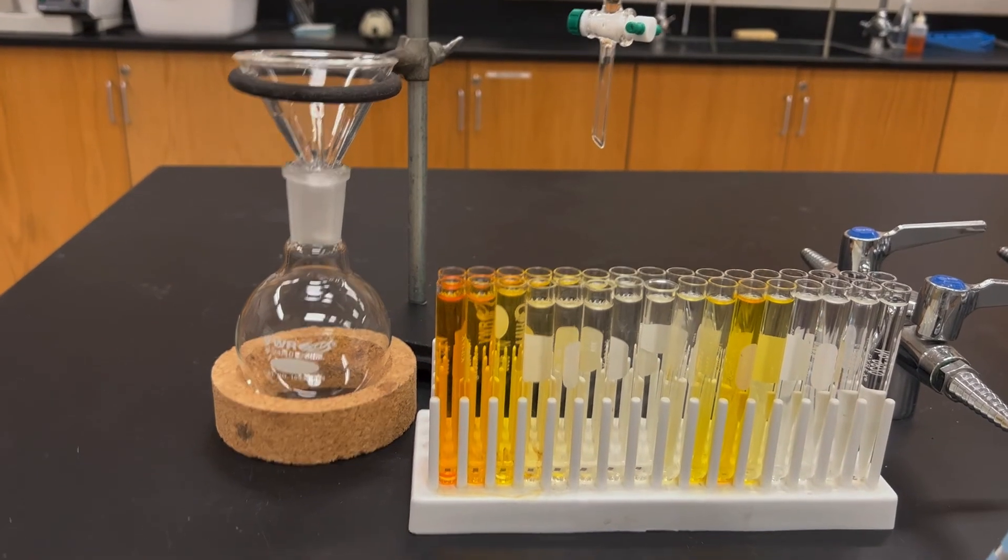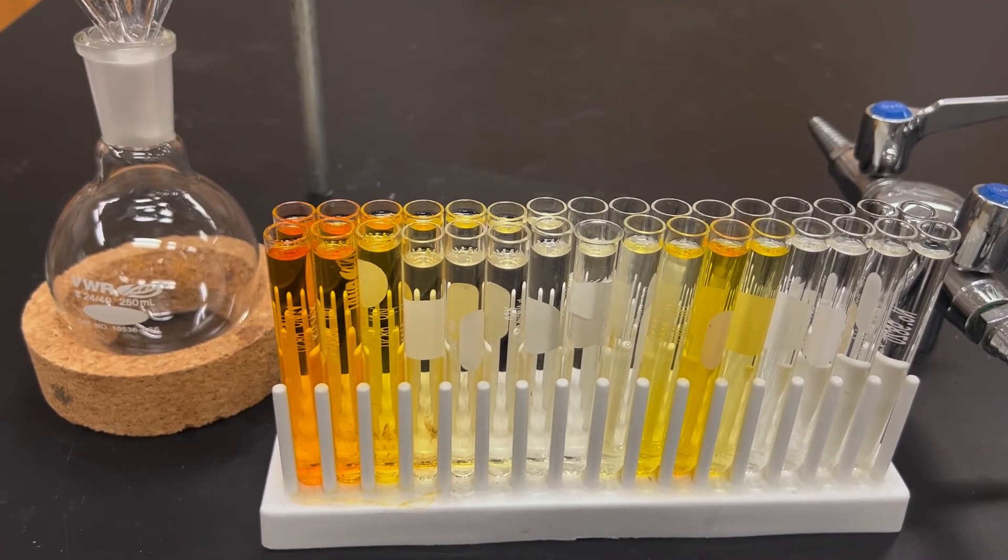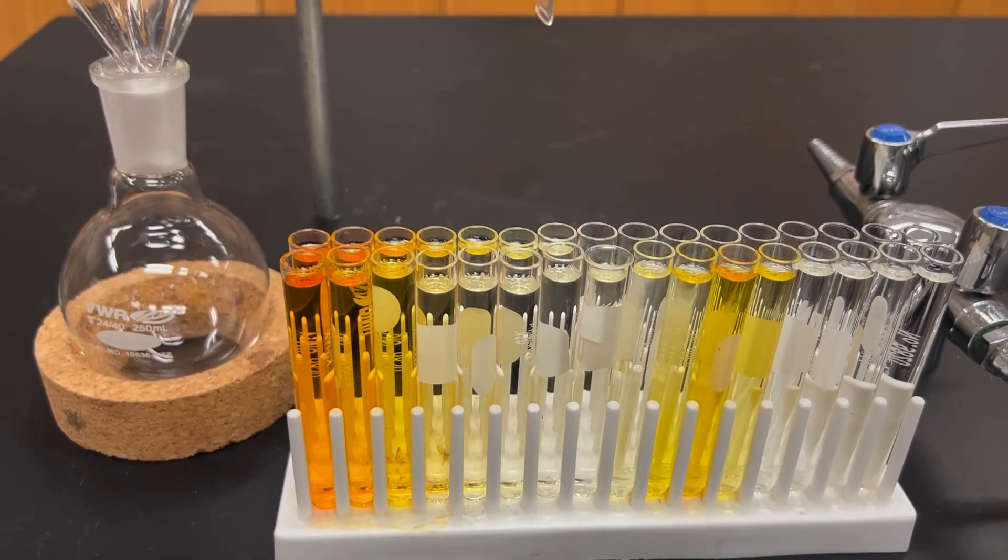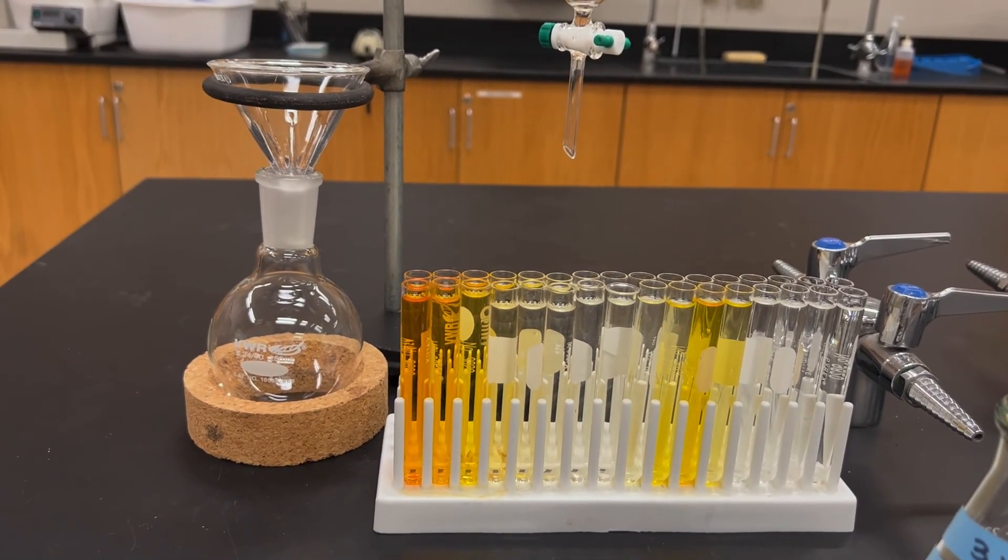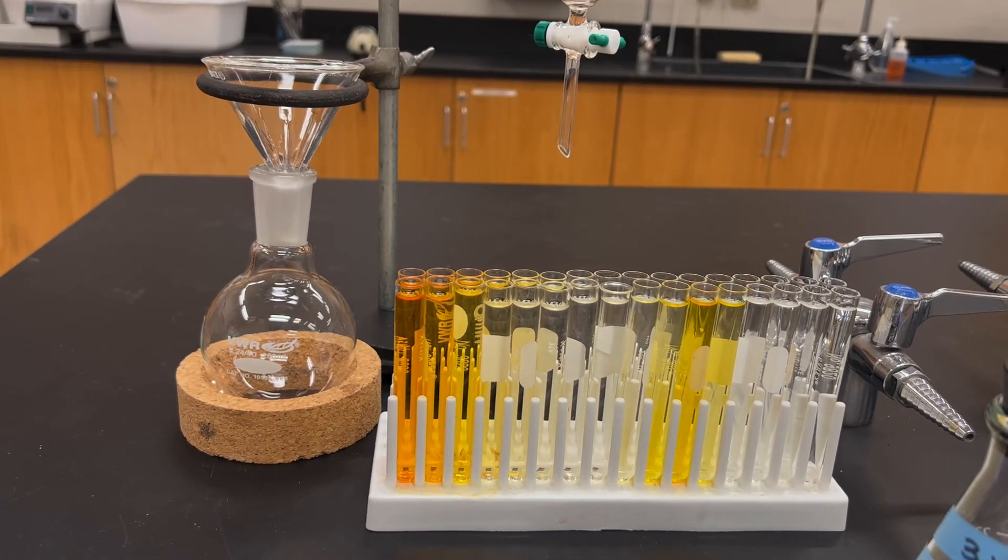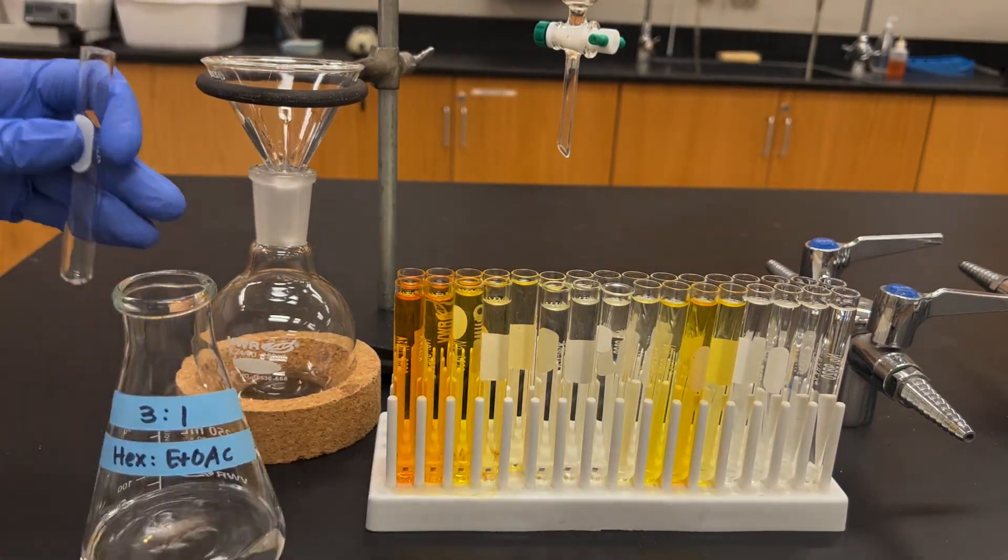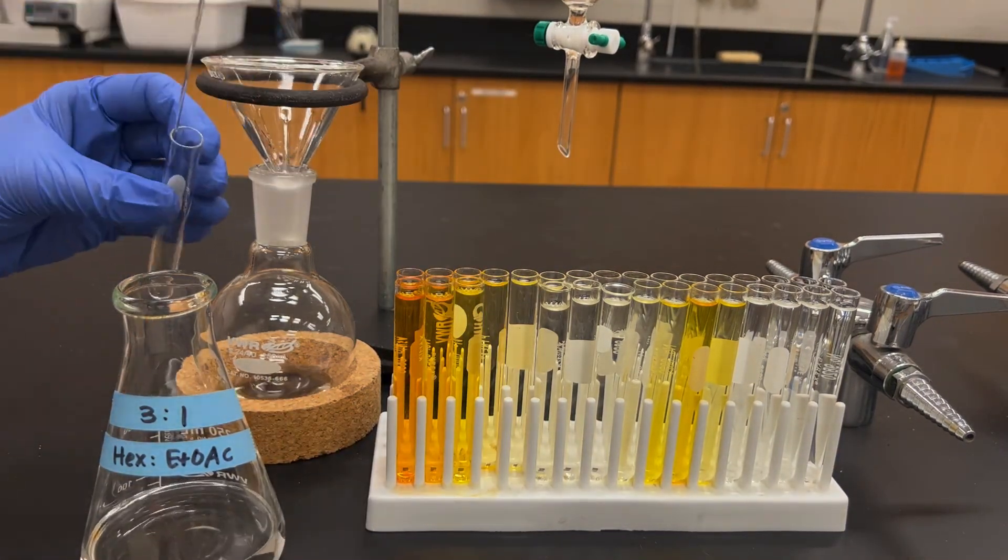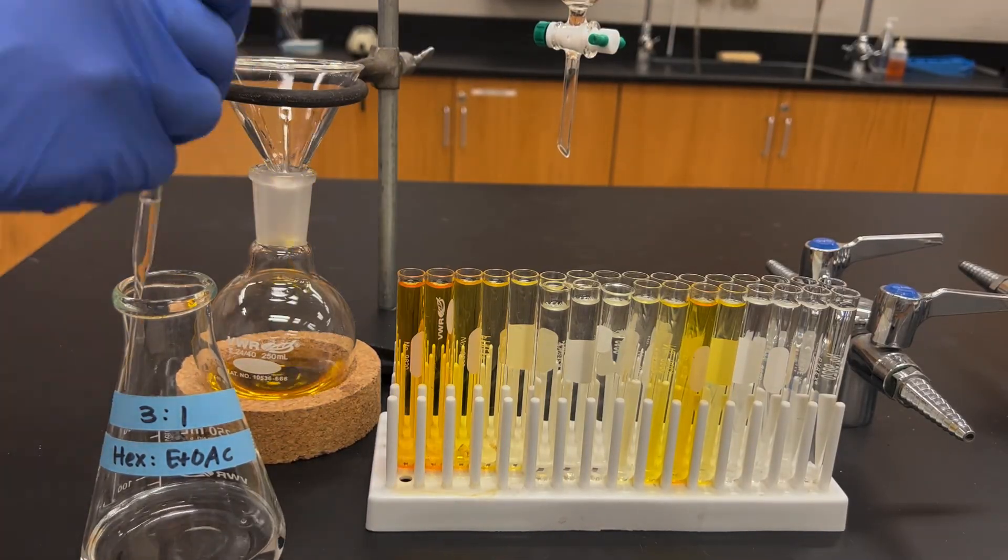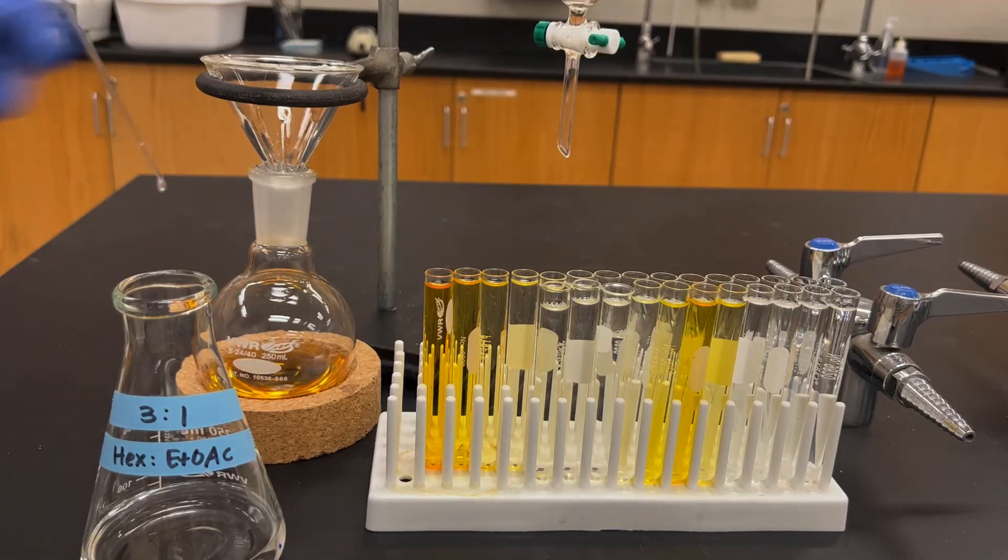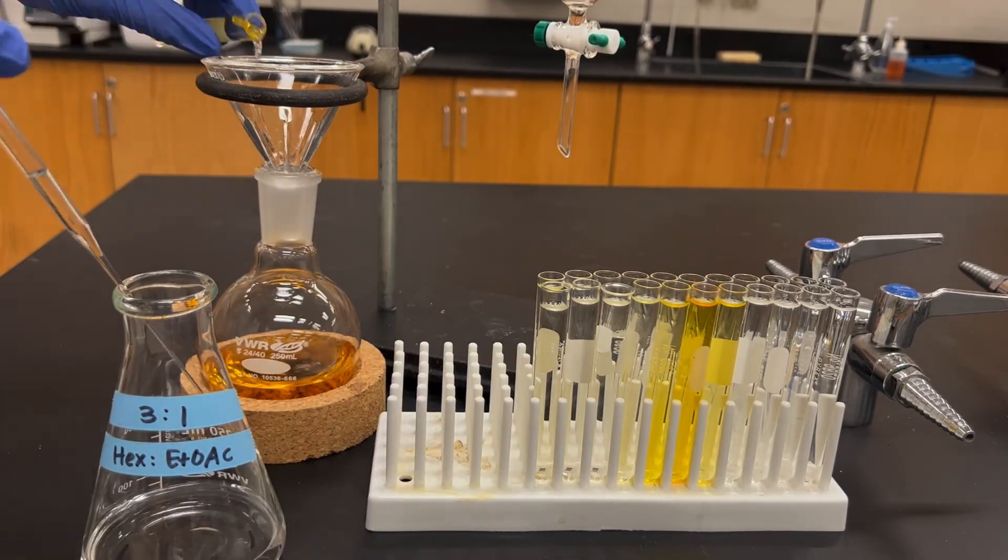After you've eluted the column it's now time to combine the fractions that have the compound that you're interested in. If you have a colorless compound you're going to have to use TLC to figure out which ones to combine, but if you had colored compounds you probably could just do this by eye. So combine the ones that you're interested in, pour those into a round bottom flask. You can rinse the test tube with a bit of the solvent that you used for the column and then eventually you can rotavap the solvent to get your compound back.